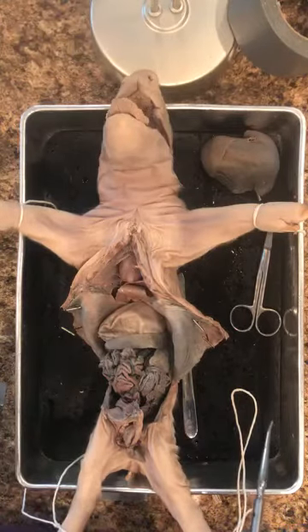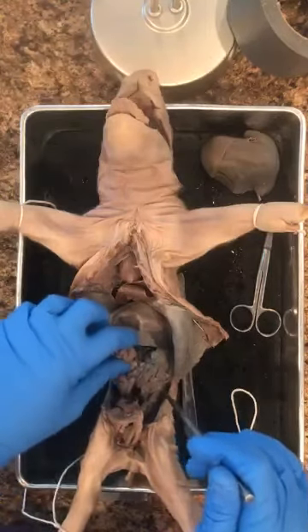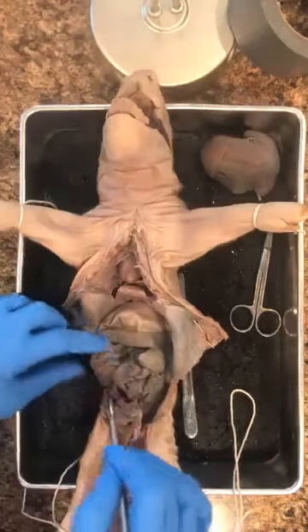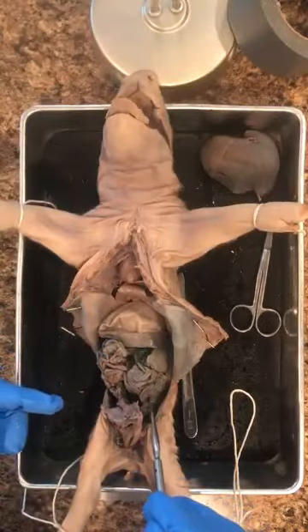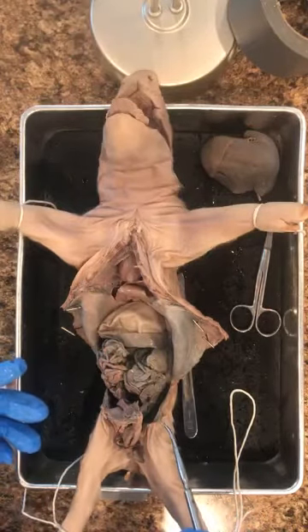Okay, the rest of the abdominal cavity here is filled with intestines. The narrower diameter ones are going to be the small intestine. So this is all small intestine right here. Okay, not here. We're all right here. That's all small intestine. And they're going to continue digesting materials or food, and they're going to absorb nutrients.